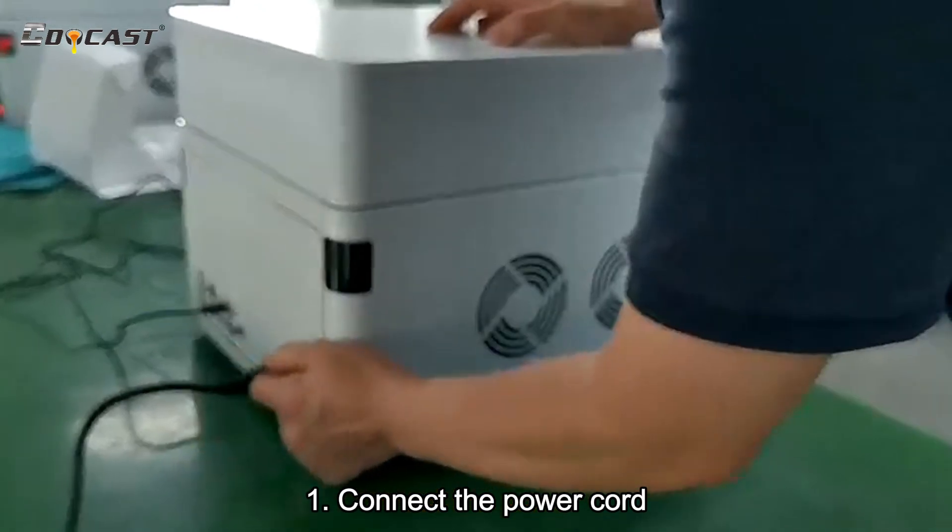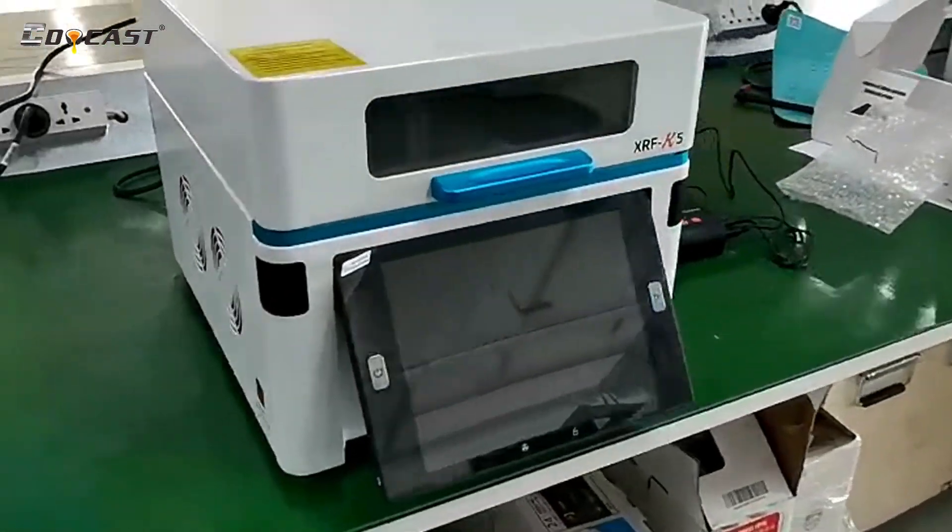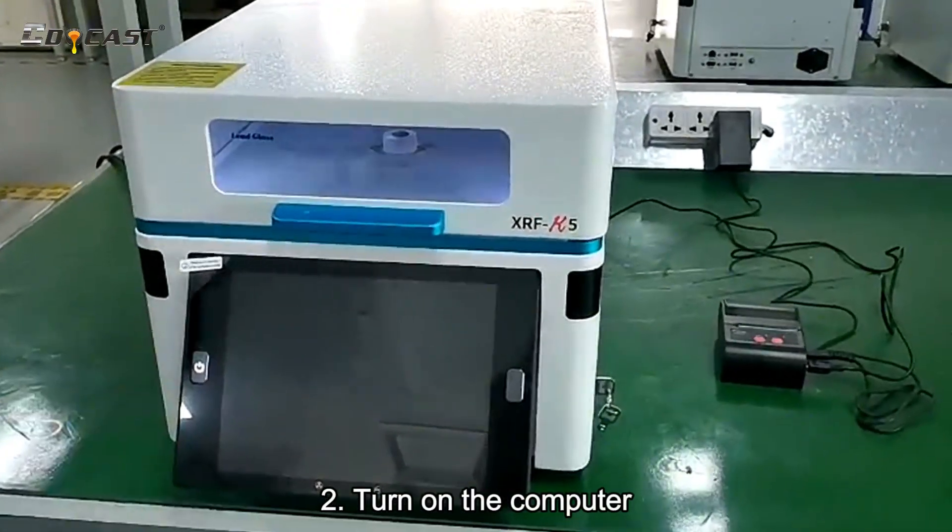Connect the power cord. Turn on the computer.